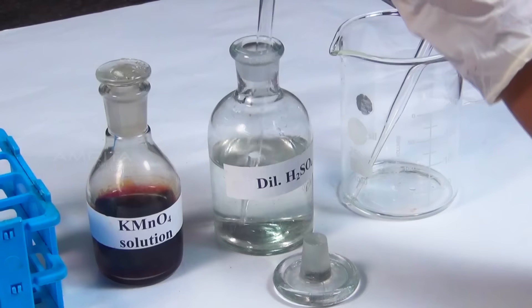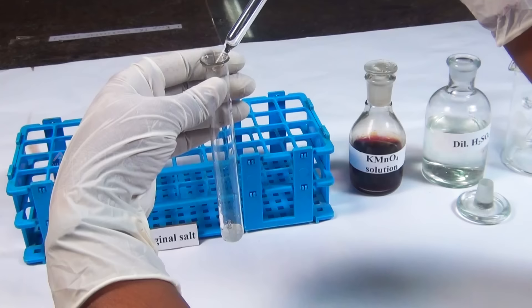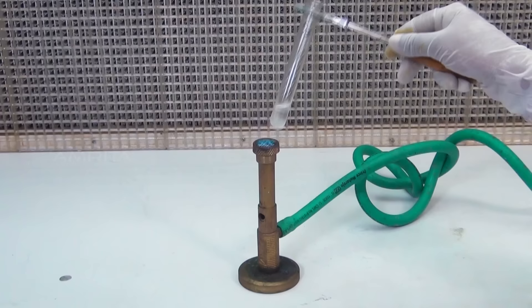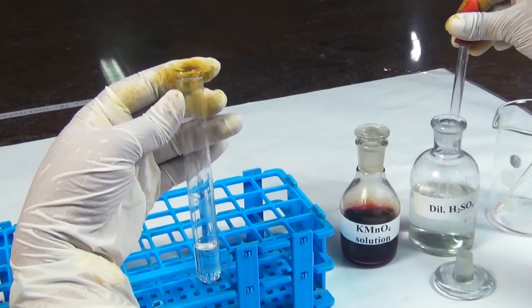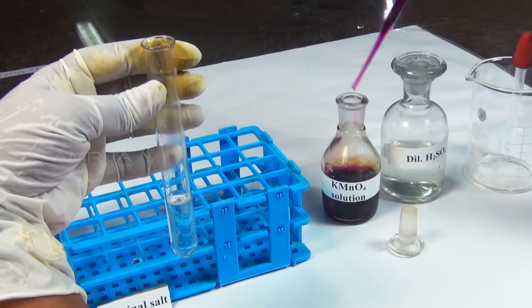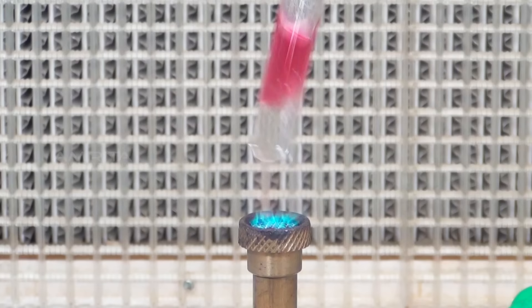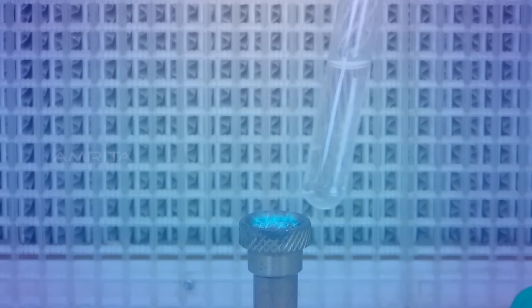Procedure: Take a small amount of the salt in the test tube. To this, add a small volume of dilute sulphuric acid using a dropper. Boil the contents over the Bunsen burner to boil off any gas evolved. Then add a little more dilute sulphuric acid, followed by a few drops of potassium permanganate. The potassium permanganate is decolourised due to the formation of colourless manganese sulphate, and carbon dioxide gas is liberated.